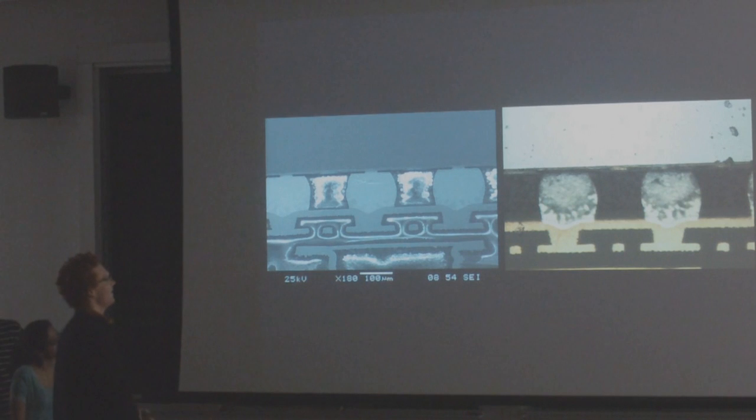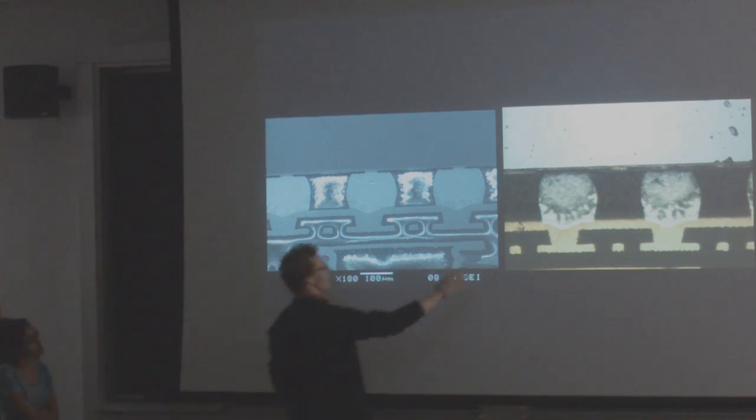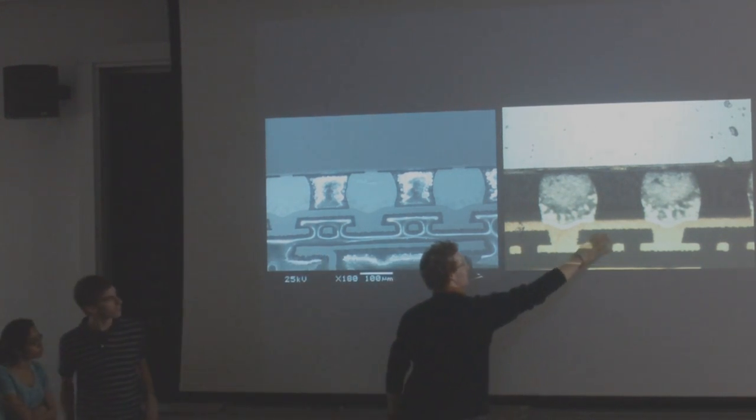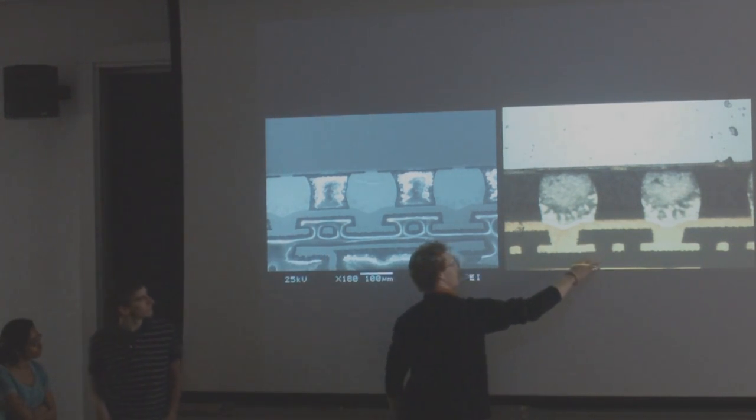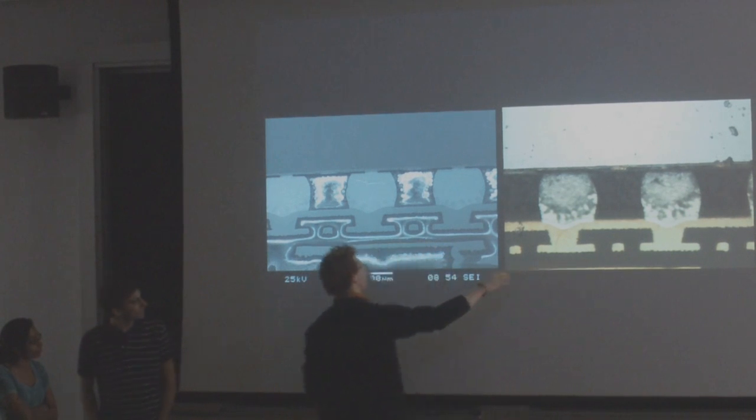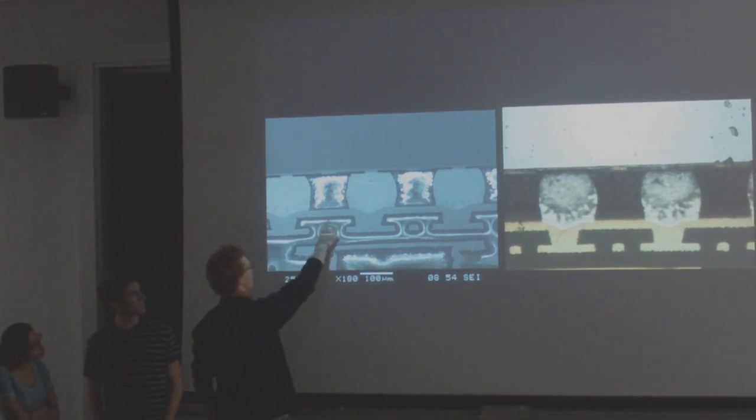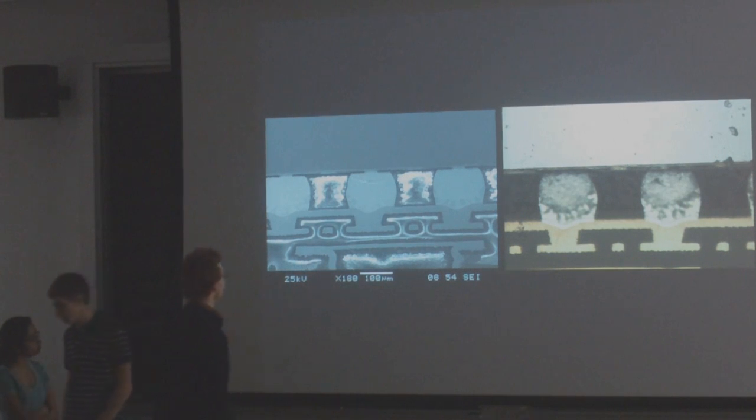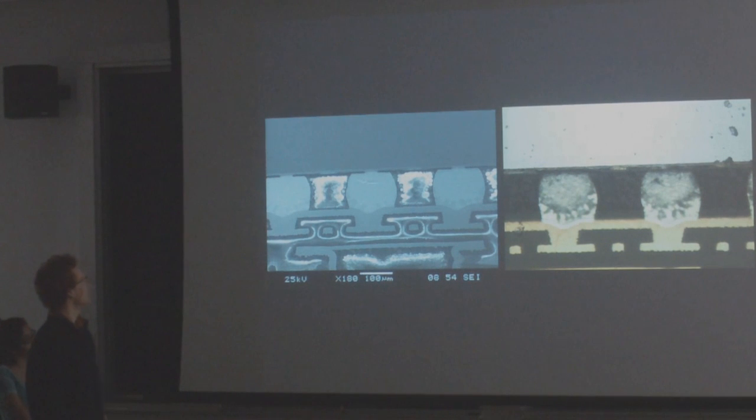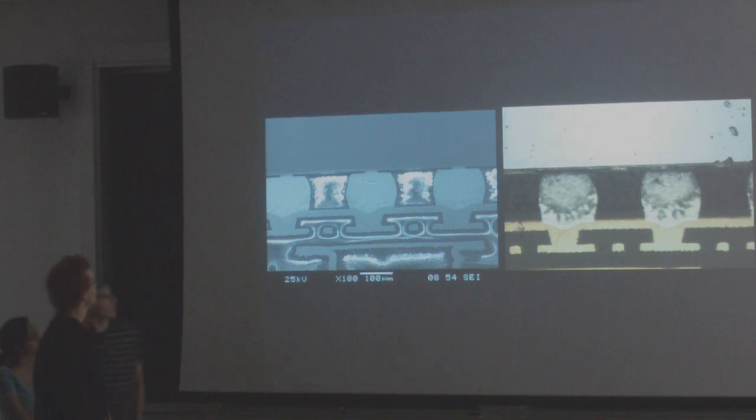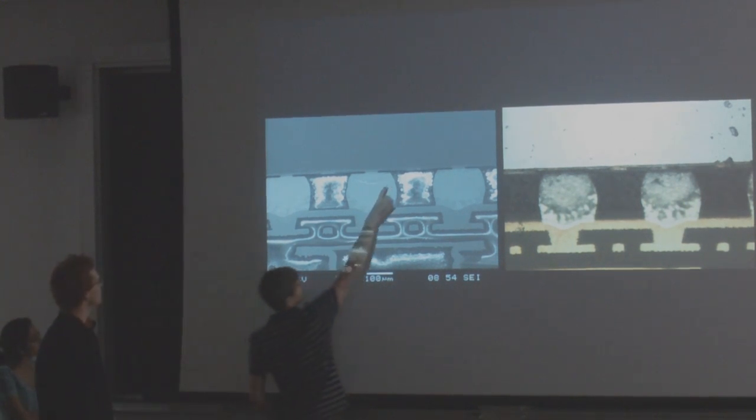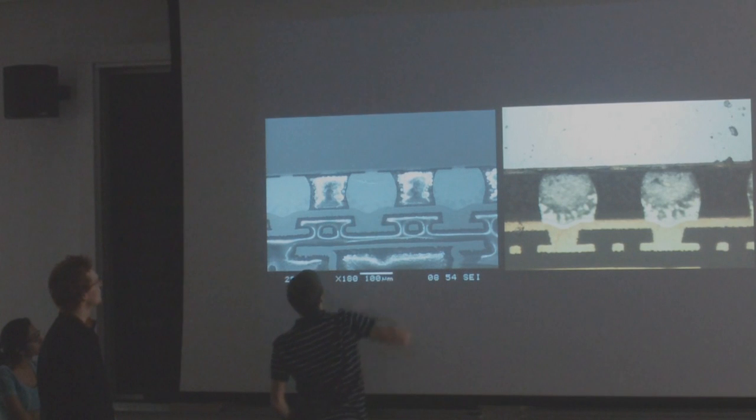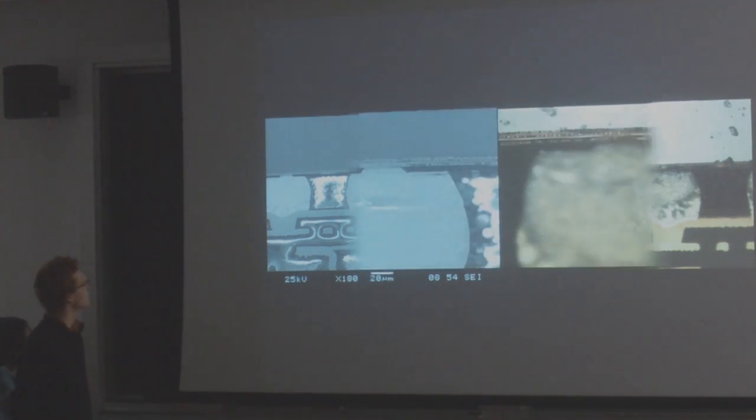Going in a little bit further. I love this picture because you can see what's flat here—this is sort of a plastic-y fiberglass—it looks like this in the SEM, sort of boosted in 3D because of some electronic accumulation. And then we're zooming in on solder bumps. Already in this picture you can start to see the layer where everything's going on, and we're going to zoom in more on that.